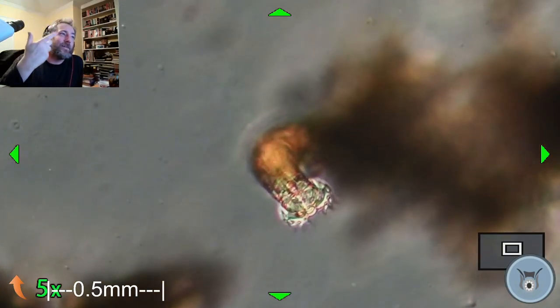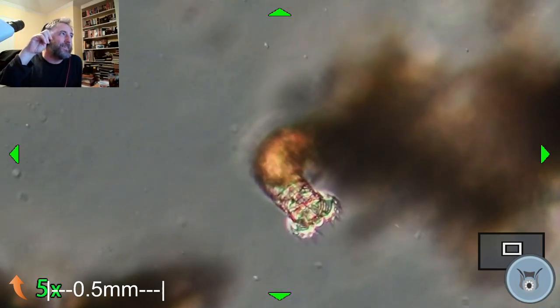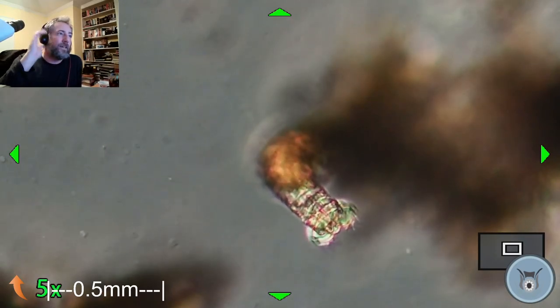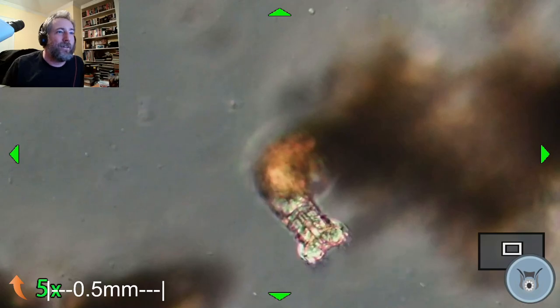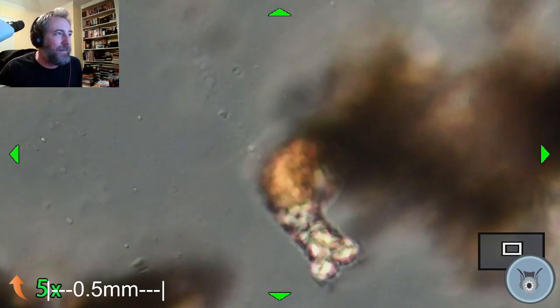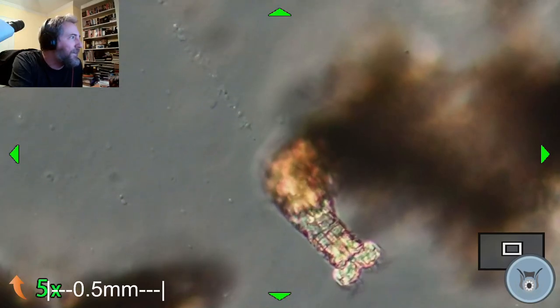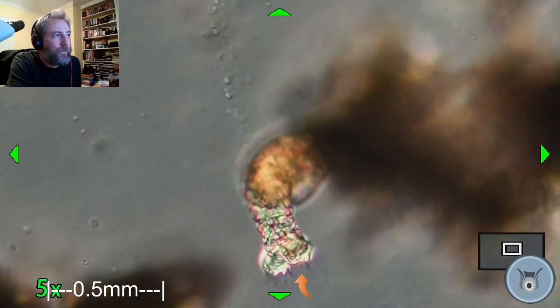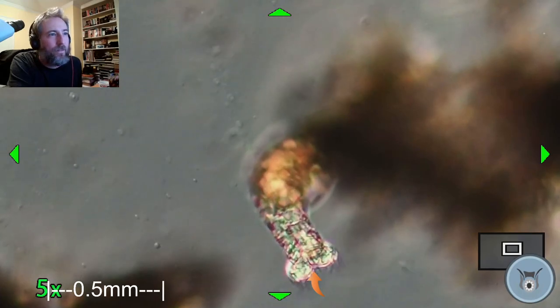The cilia, which are actually just a bunch of little hair-like things, are doing like this. They're sitting in one place and they're just twisting. But the fact that all of them are doing it makes it look like they're actually spinning like a saw. So the mouth for this organism is actually, let me try to get this for you, it's right in between those. This structure is called a corona. It's at the top or the head, like a crown. That's what that word means.